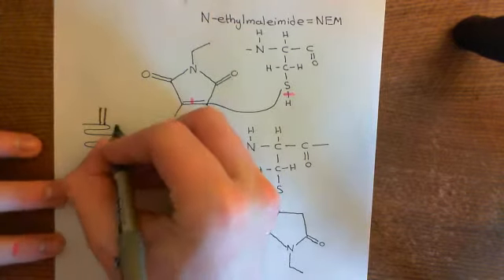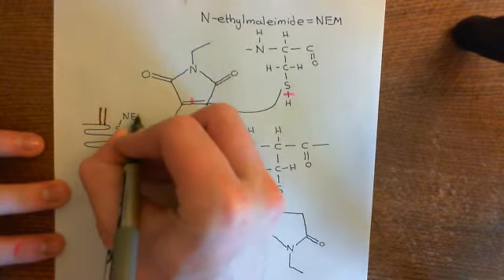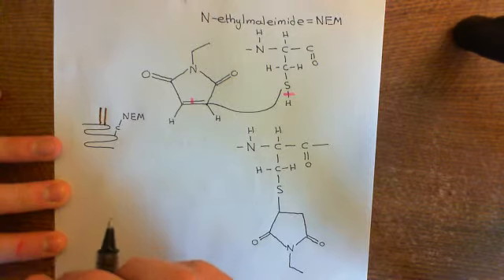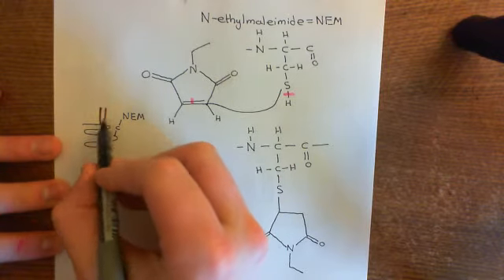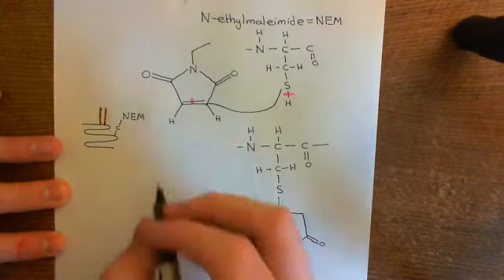And now what you're going to do is bind this N-ethylmaleimide molecule onto that cysteine residue. This N-ethylmaleimide molecule will bind to the free cysteine residues, but it will not bind to the cysteine residues that are palmitoylated. So it will not displace the palmitoyl groups to bind to those cysteine residues.